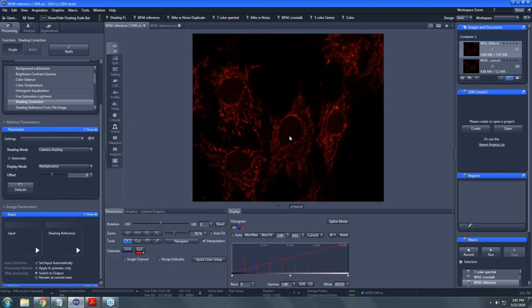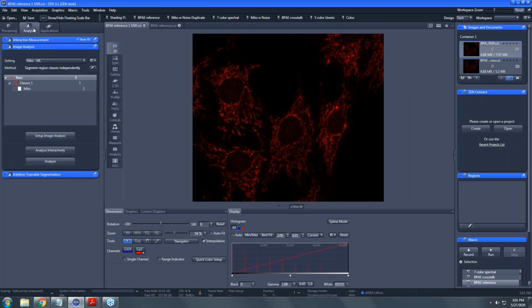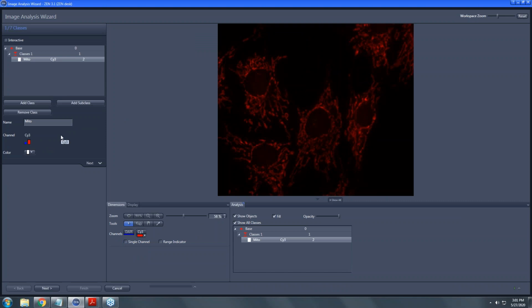All right. So let's do classic image analysis just to remind people how this works on the reference sample, if we could, Nicole. We're going to select the configuration for Mito Classic. And hopefully most of our audience has been here for the classic image analysis, but let's just go into the setup and point out that the way that we're identifying the mitochondria is by an automated threshold.